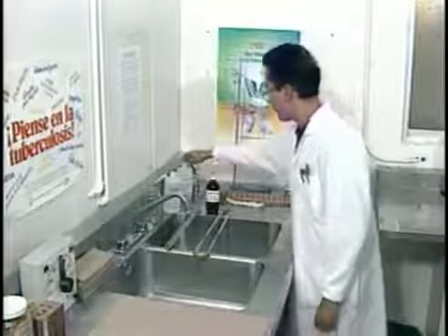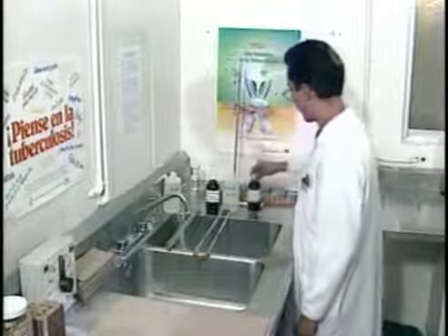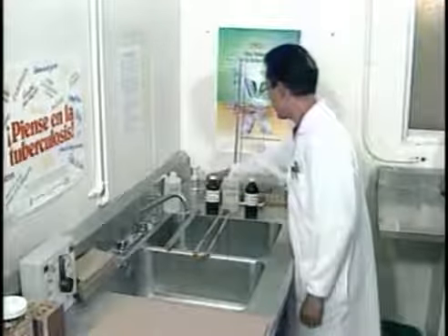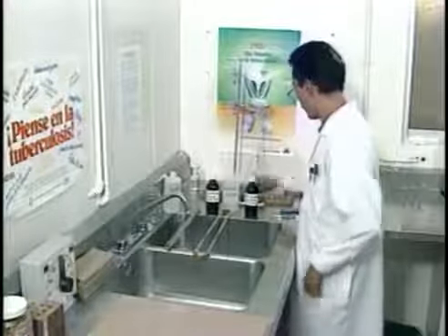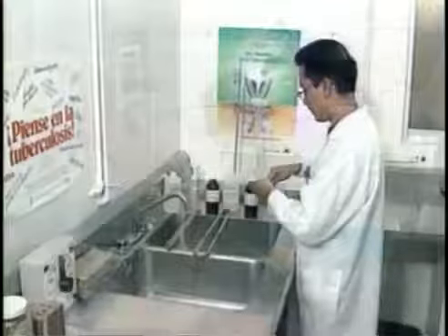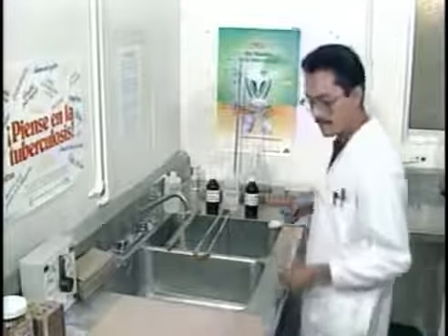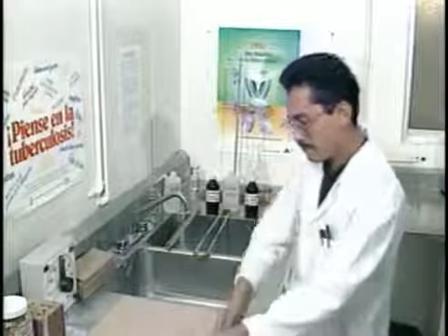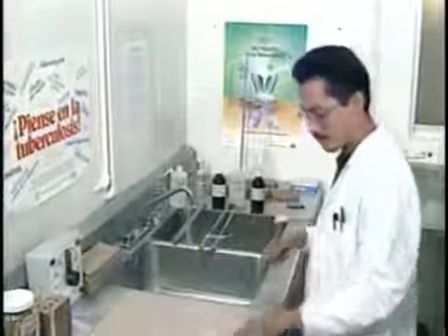On the table counter next to the sink, place the following items: staining reagents, clock, forceps, cotton alcohol holder or Bunsen burner, and tray containing fixed slides to be stained. A slide rack should be placed in the sink.